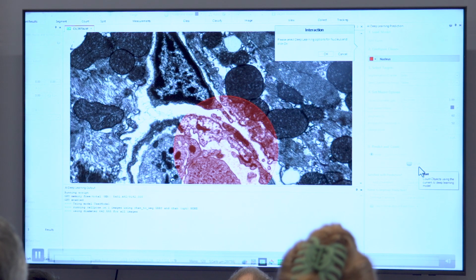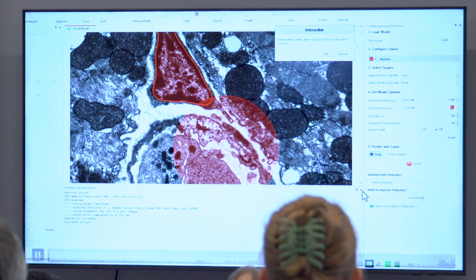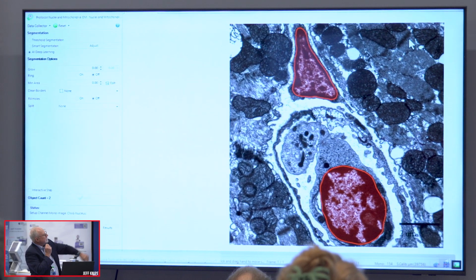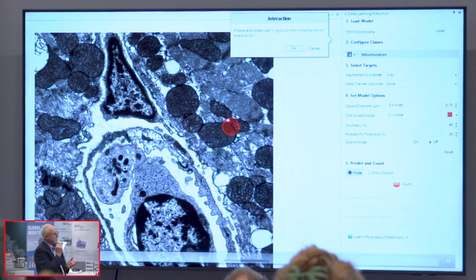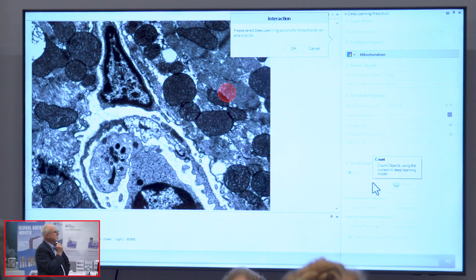Again, verifying segmentation. This is just showing that it's running the deep learning. Once you verify the segmentation, press OK and continue. I really didn't talk too much, but we also include a few other settings that if you need to do clean borders or anything like that, want to count whole intact object cells, you have those choices. So again, it's just exposing the tools that you need. Again, these can be edited and modified for your own needs.